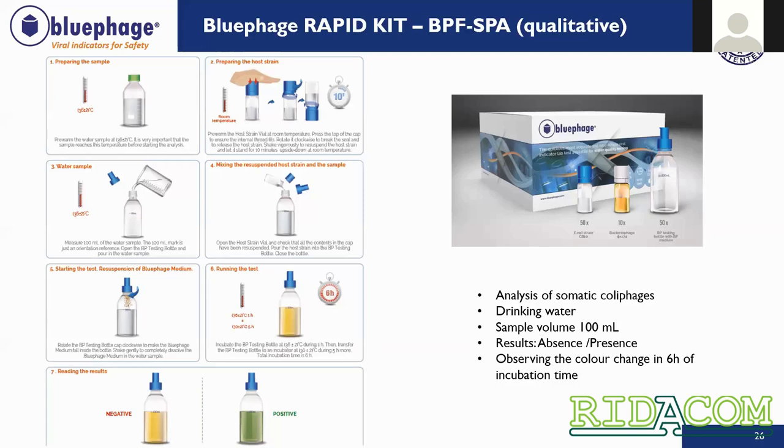After this incubation time, if our sample is still yellow, there is no presence of coliphages. If it changes color to green, we have presence of somatic coliphages and the water is not safe.